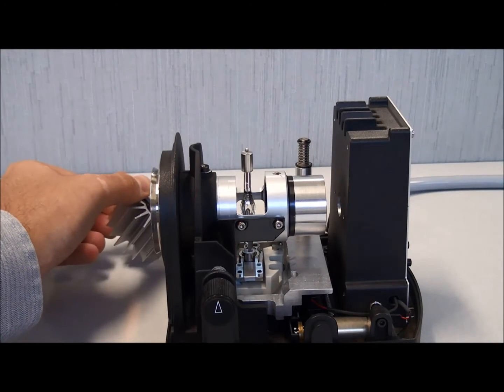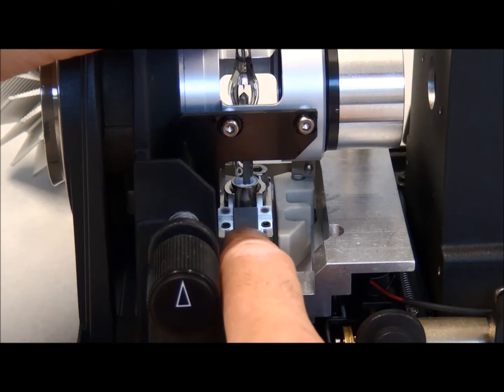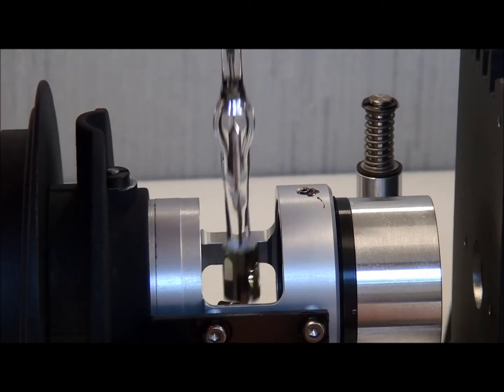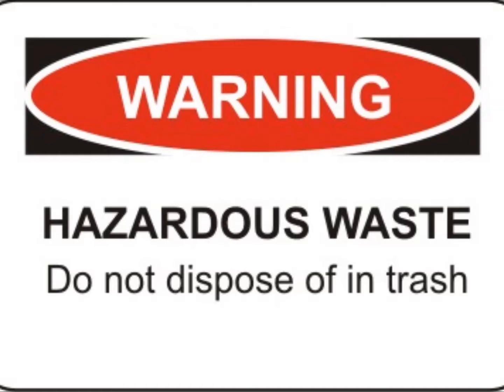The bulb is now held in place by a second tension lever at its base. Hold the top of the bulb, depress this tension lever, and pull the bulb straight up. The used bulb contains mercury vapor and should be disposed of properly according to the procedures of your facility.